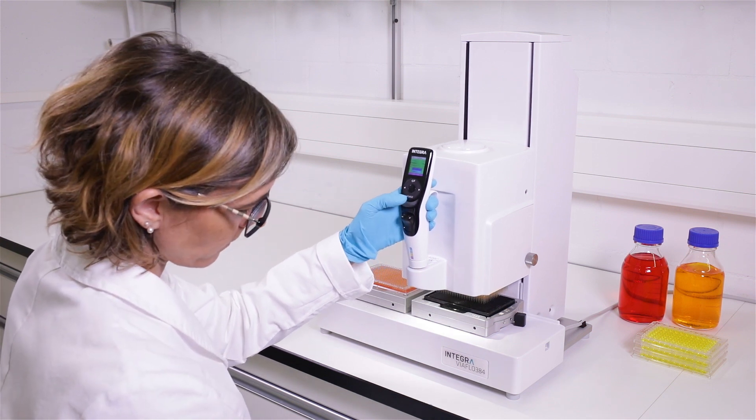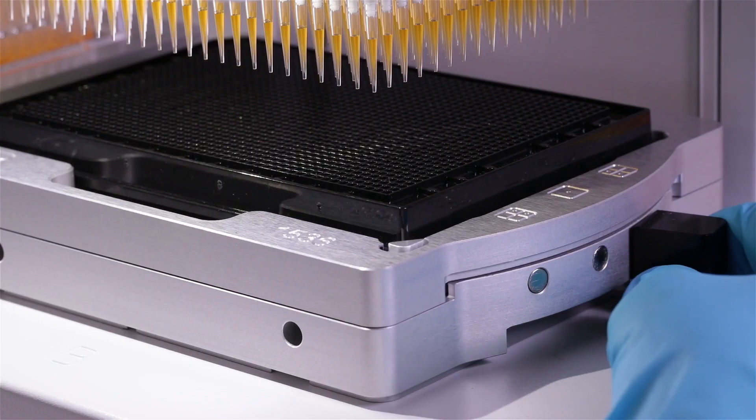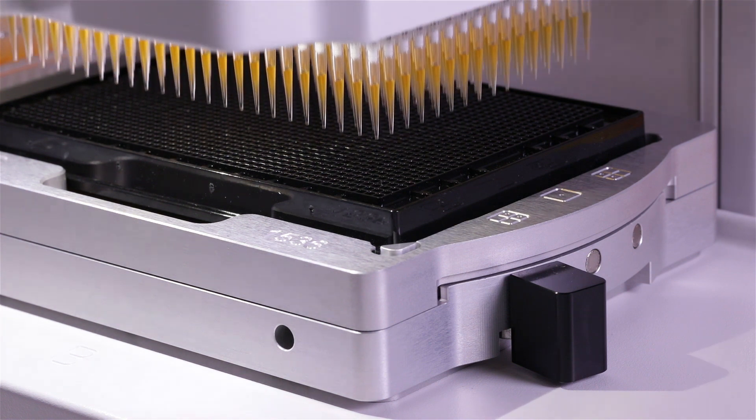The procedure is the same as reformatting 96-well plates to 384 format. Simply shift the lever to access the wells in the front and the back.